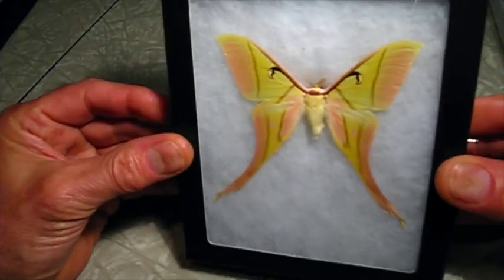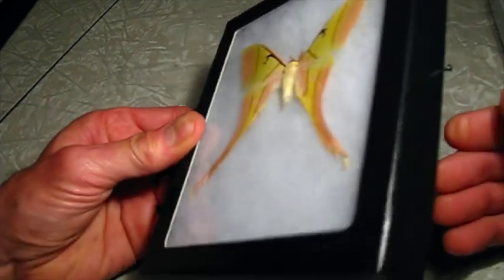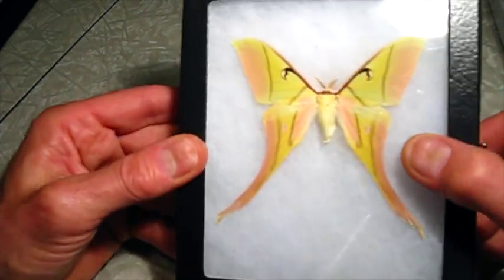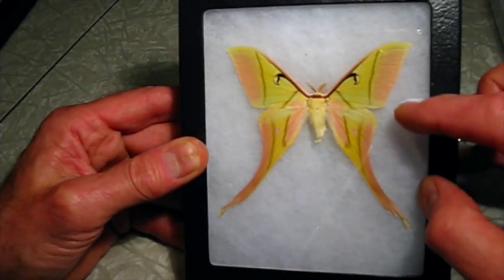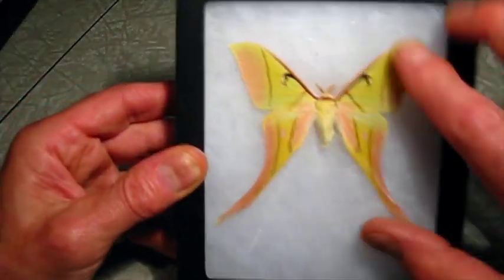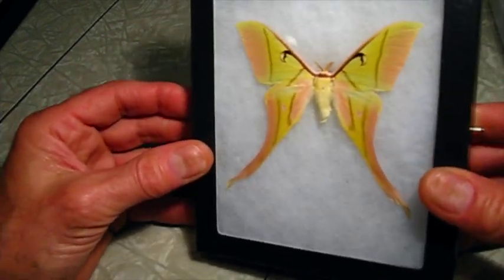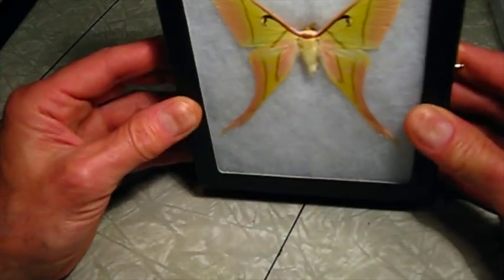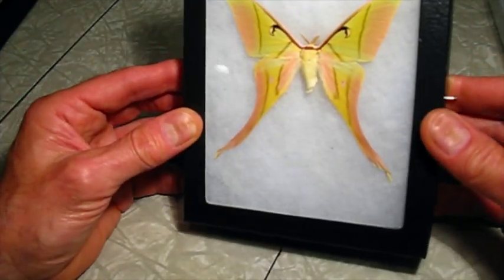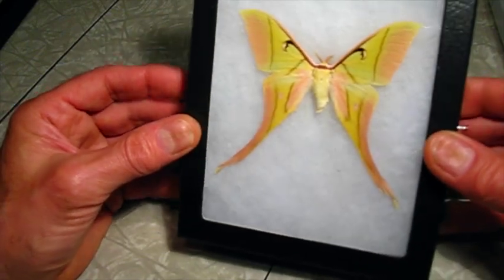This is one way that these insects are preserved and shipped. This is called a Riker mount — just a box with a plastic window on it, sometimes glass, with cardboard and some cotton to hold the specimen. It's a good way to keep them safe; you could hang it on your wall. But my teaching collection is all pin specimens, and I prefer to do it that way.